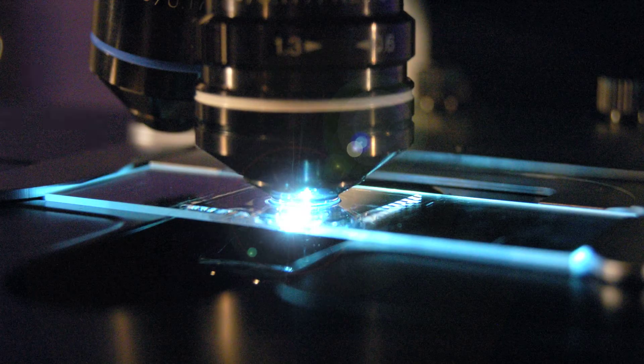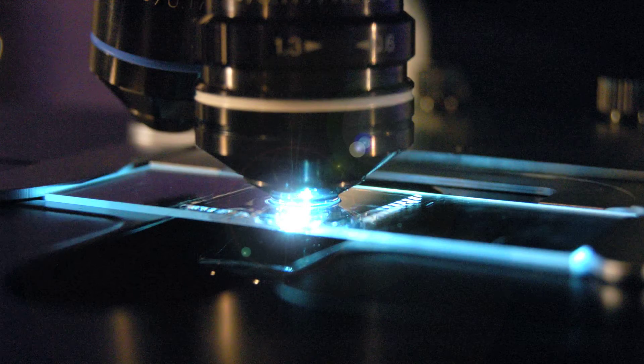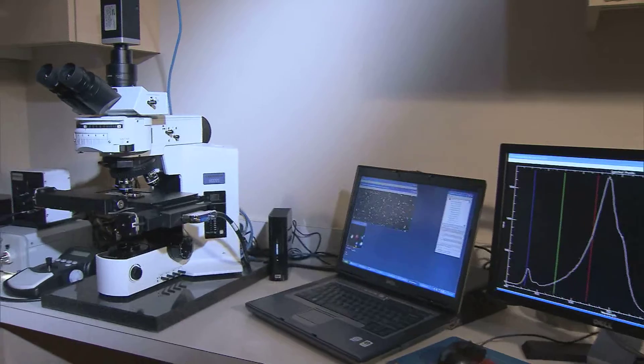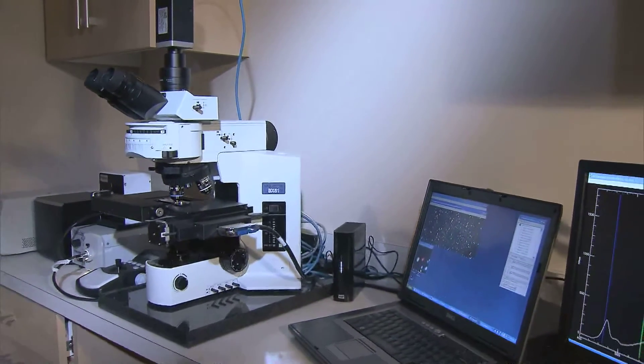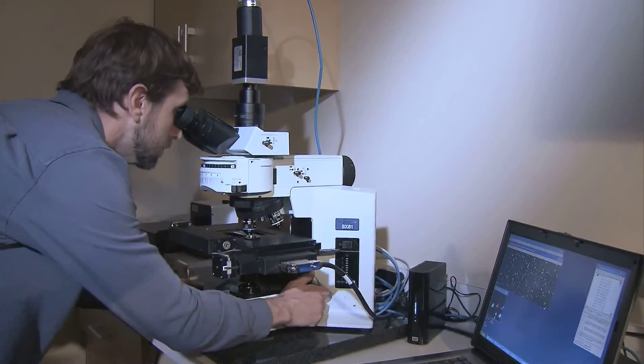The CytoViva Hyperspectral Microscope was specifically designed to provide optical observation and spectral characterization of a wide range of nanomaterials.